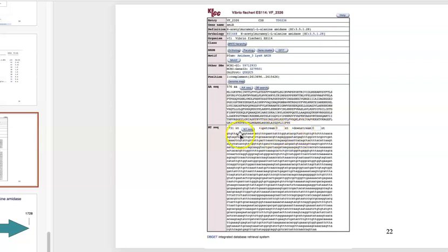So here's the start, the start codon is theoretically over here, and the stop codon is right here. But what if I wanted to know what the promoter looked like? I don't know exactly where the promoter is, but I know that it's upstream of this. So I would ask for 200 nucleotides upstream and get all those nucleotides, and then I can study that DNA and clone it potentially and study where the essential RNA polymerase and other transcription factor binding sites are.